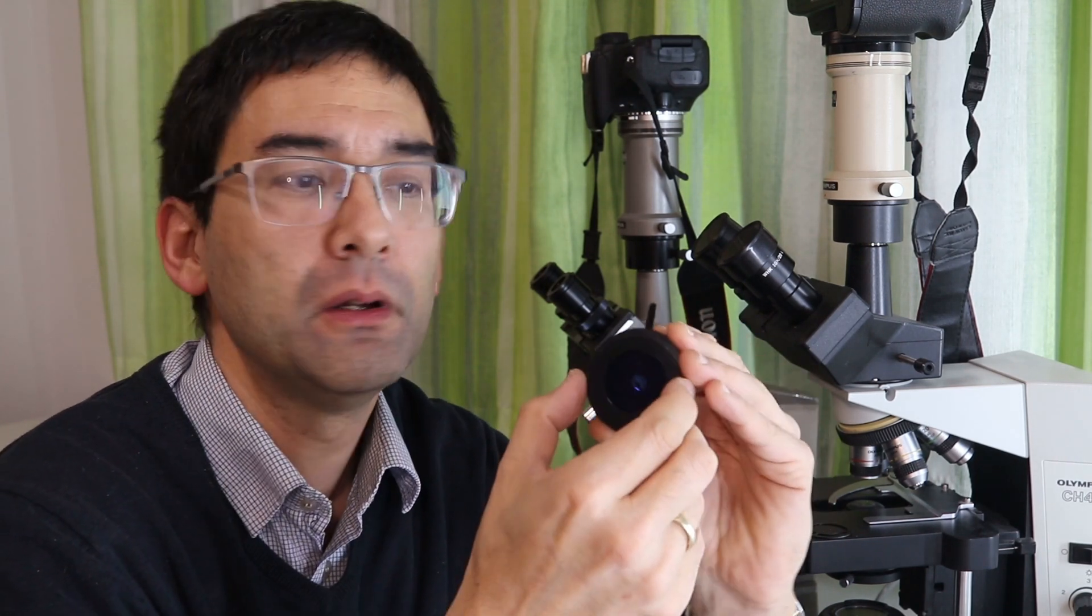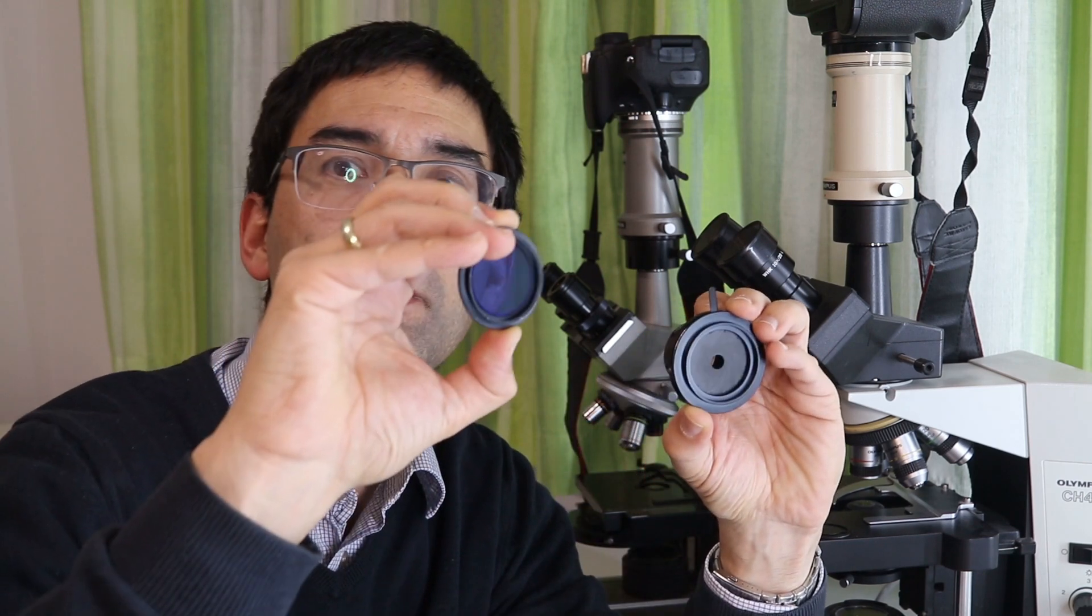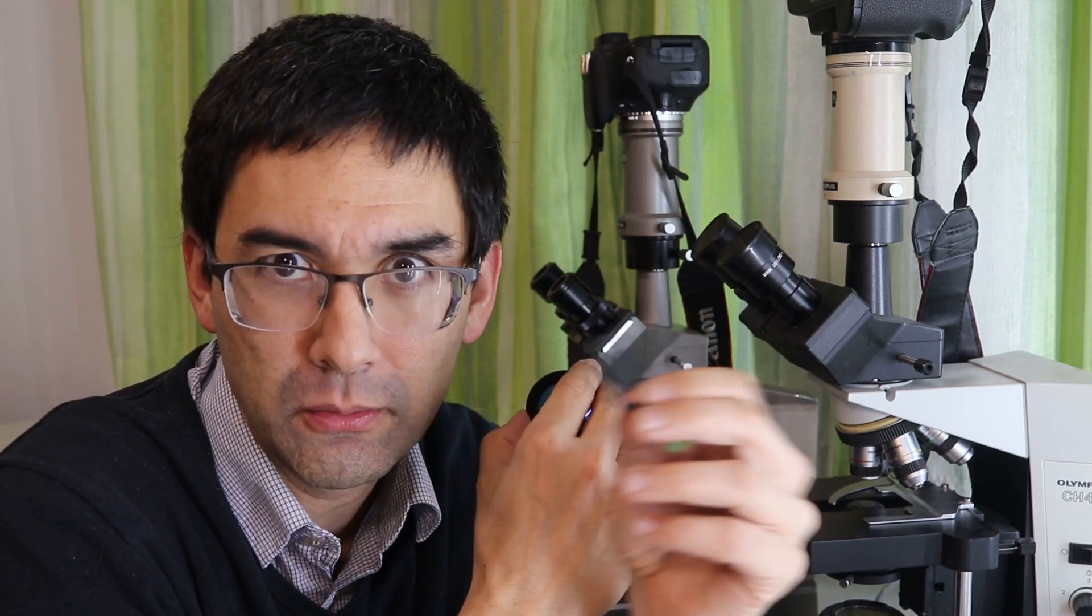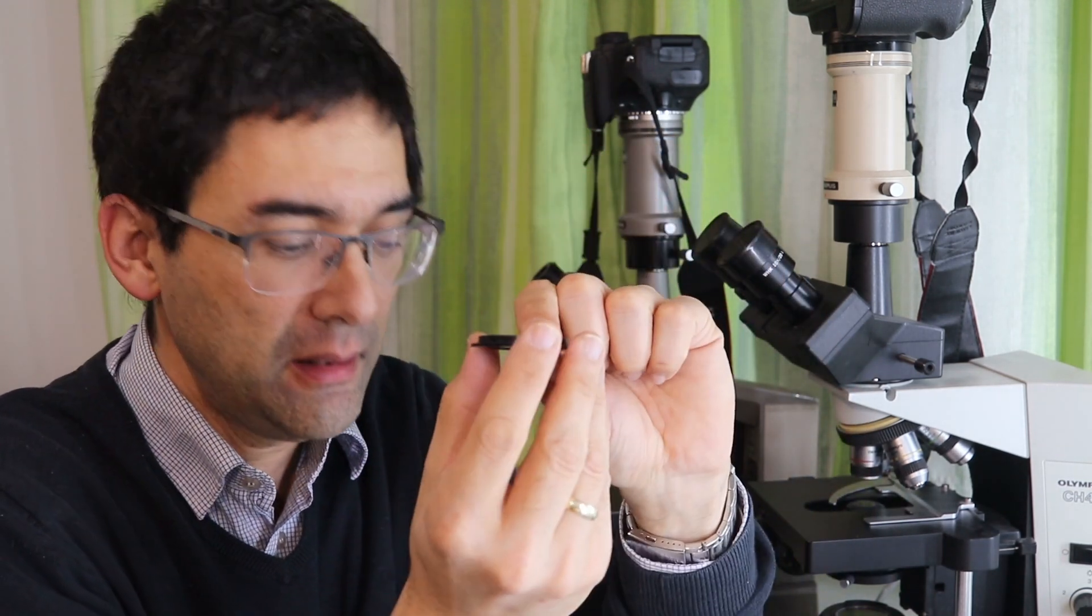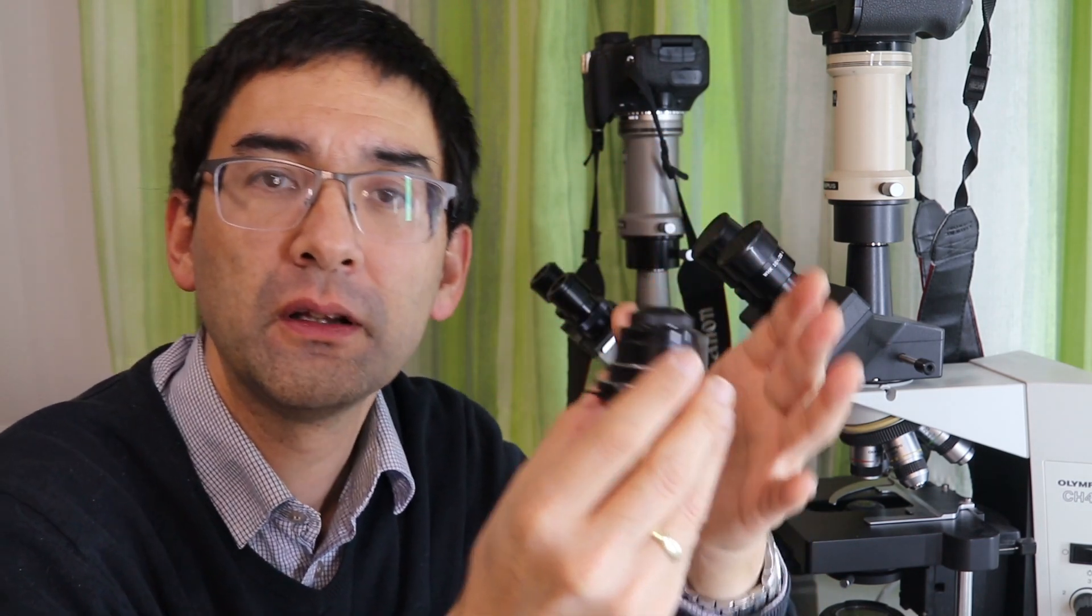Because here on the bottom, what you can do is there's a filter holder. And if you can take it, you can take it off. That's a filter holder. It's a blue filter to balance the color temperature. And if you want to have dark field, what you can do is you can take this dark field patch stop. If you don't have one, you can make one yourself if you want to. And you put it into the filter holder like this. And then it goes beneath the condenser. And then you have dark field.